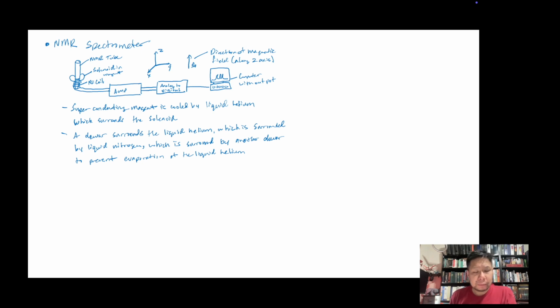So we would refill the helium on our NMR instruments about once a month, and because the nitrogen evaporates as well, even though it's inside of a dewar, that is changed out once a week. So liquid helium once a month, liquid nitrogen once a week, and it was a pretty important job, because without what we call cryogens, those are both called cryogens, if we weren't doing any cryogen maintenance on the NMR, we wouldn't have a superconducting magnet anymore, and you wouldn't have a high field magnet to do your NMR studies, right?